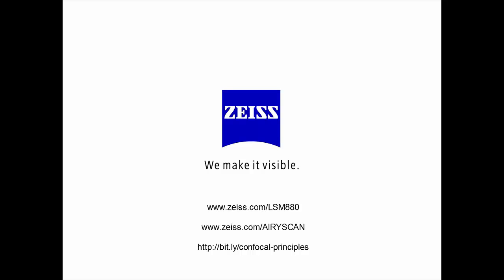So Elyra has slightly better resolution. It's also going to be quicker for bigger fields, and arguably for some samples it could be more sensitive. I say arguably, you could argue that the Airyscan on some samples may be more sensitive. It's going to be a long-running debate here.